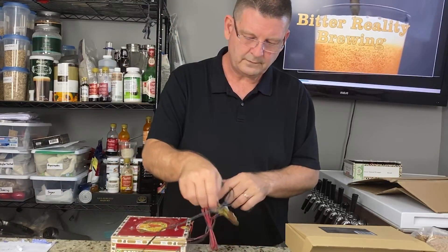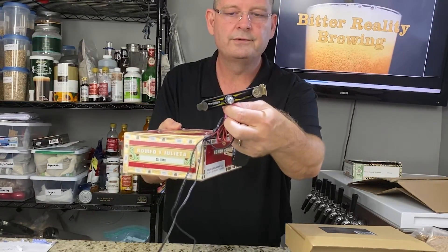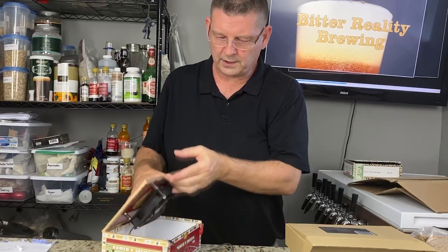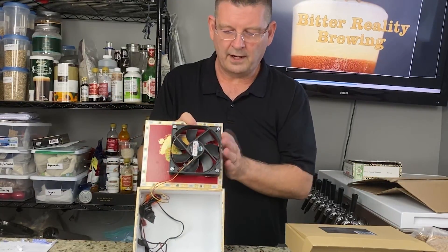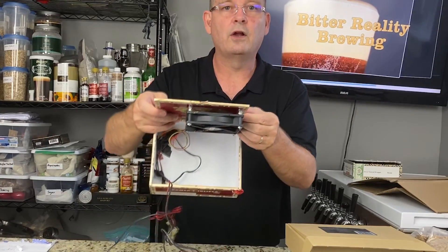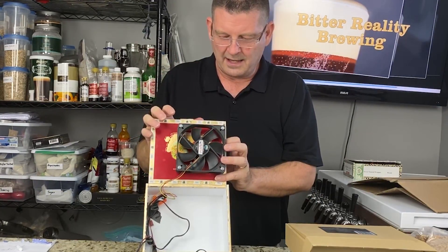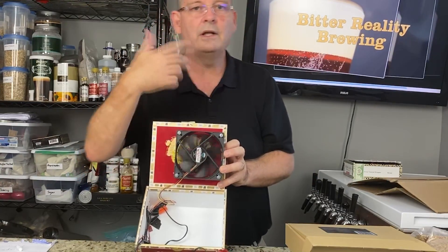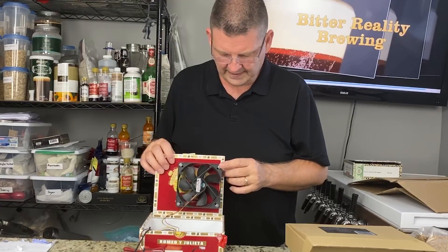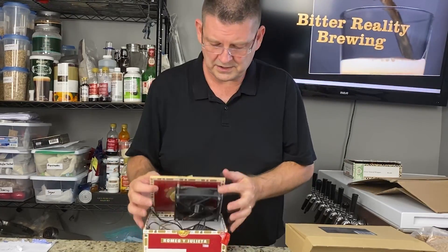The other way of doing it — you can grab a controller, this is a fan controller from a computer, and it helps regulate how fast the fan goes. Same 12-volt power adapter. The difference in why this one works is it's a 120-millimeter fan — the 120-millimeter fan is the magic, that's the perfect size. But it did take a lot of messing and adjusting. Honestly, there's a much, much, much easier way.